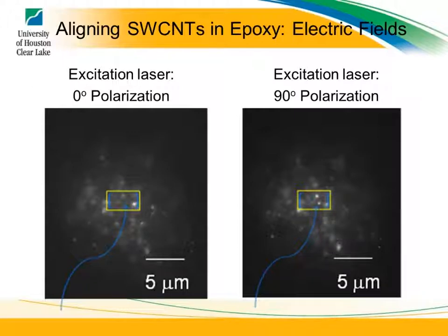It's not real intense, and you can't see it with your eye, of course. It's laser light, you can't see it with electric light. And you have to detect it using near-infrared. But there may be a way to put a polarizer on the other side. That's what you're saying, right? I don't know if it's polarized, it could be unpolarized. I'm not sure. I think it's unpolarized.